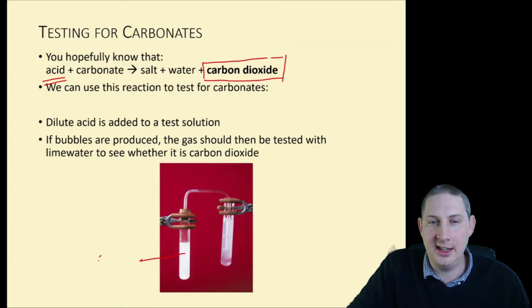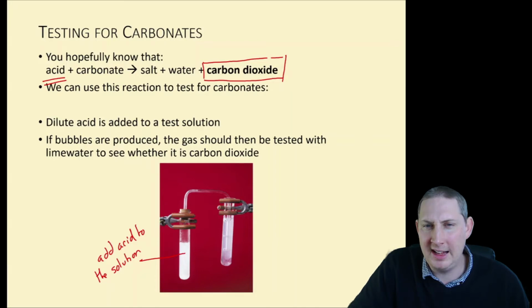We add acid to the solution, and if a gas is formed, we bubble the gas through lime water.